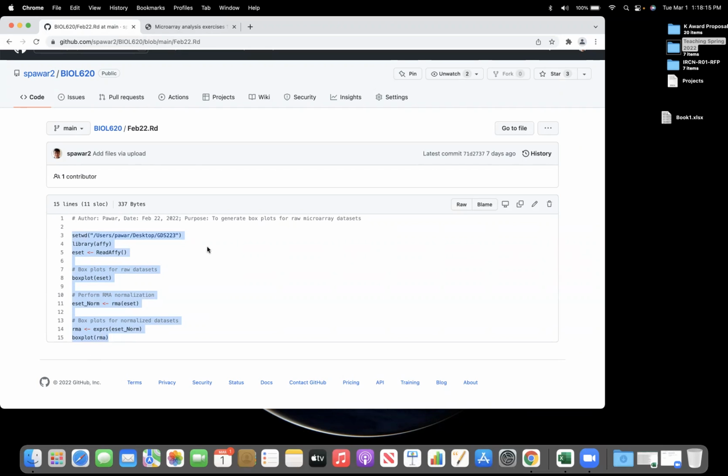So once that is taken care of, then we can go ahead and do the analyses, right? You cannot do the analyses on the raw Affy data, because you'll get false positives, false negatives, because the variance is not right. But now the variance seems to be quite consistent across the samples, so I can go ahead and do the analyses.